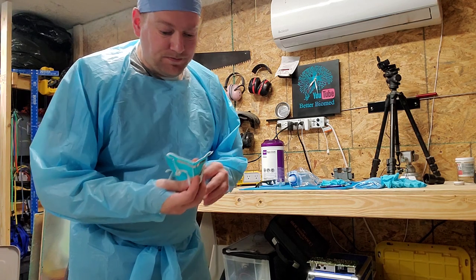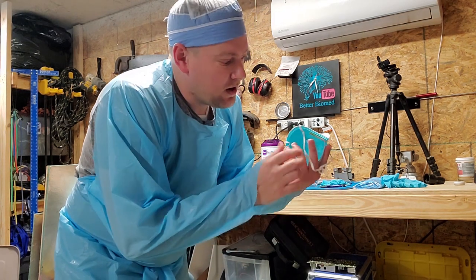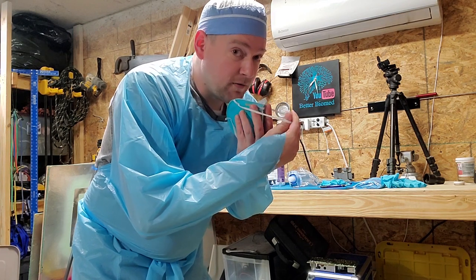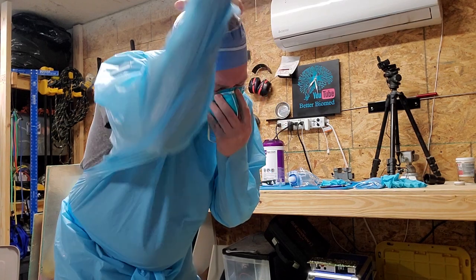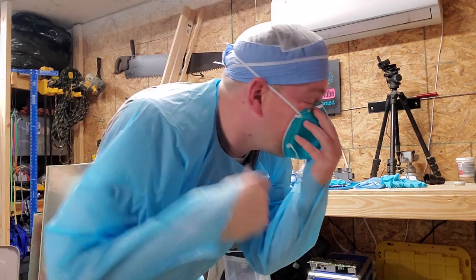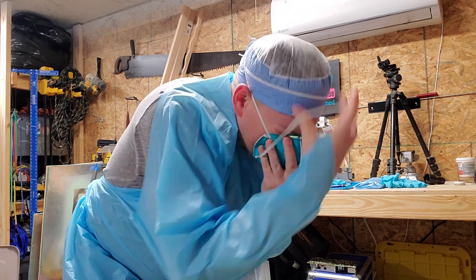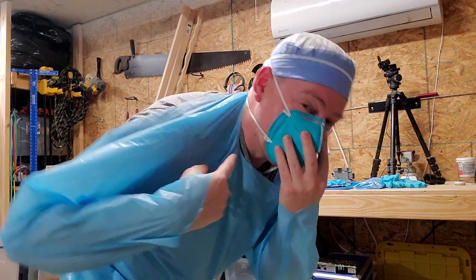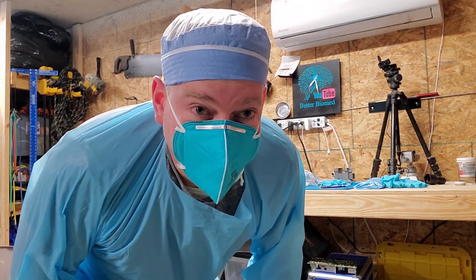So what you're going to do is you're going to start out with your mask cupped in your hand like this. Okay. So I've got the metal strap up here by my fingers. You take it and you place it over your face, so it's got a good fit. And you take the top strap and you put it around the crest of the back of your head. Okay, like that. And then you take the next strap, the one below it, and you place it down along the base of the neck, down below the hairline. Then your mask is on.